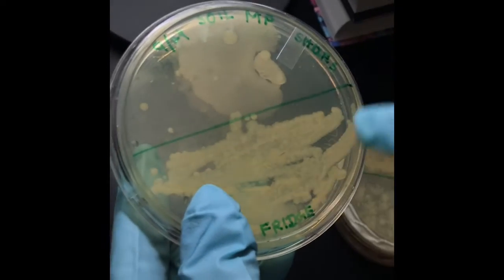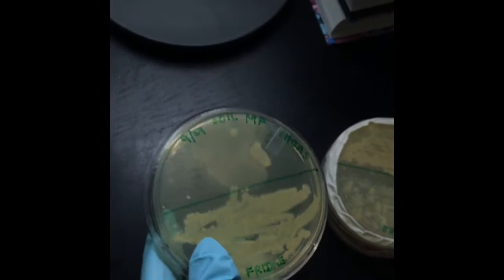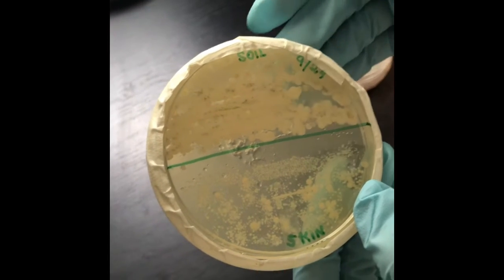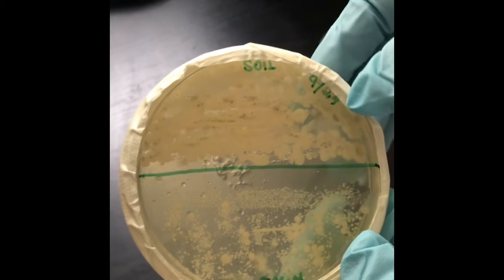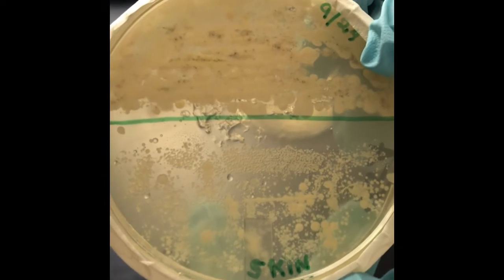But this is the growth of a swab, one from the fridge and one from the shoes, on a TSA plate. This is another TSA plate, and the swab was taken from the soil. You can see this portion, and this part, the swab was taken from my skin.